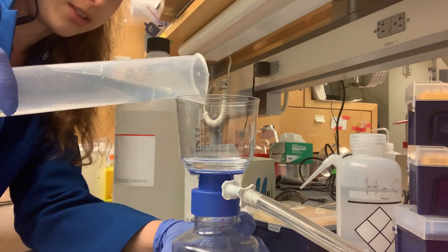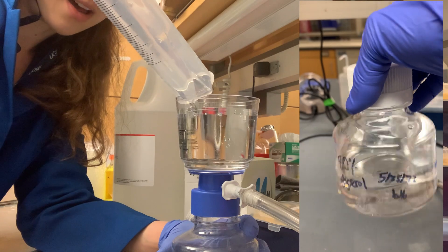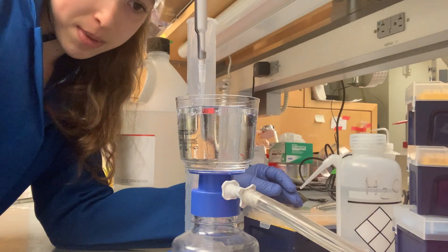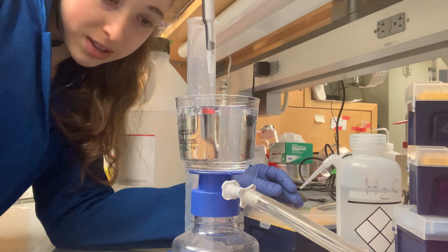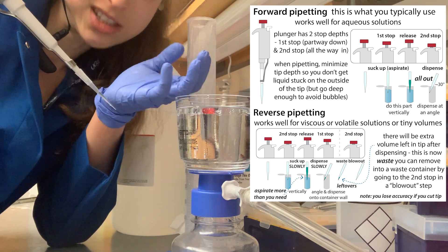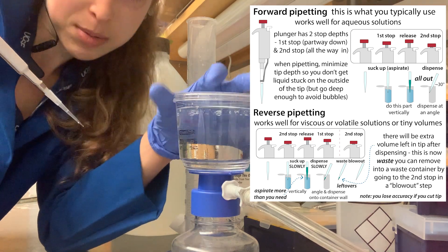There you can see it dripping through, giving you a filtered glycerol solution. You might have to leave it for a while, but in the end you'll have a solution that's much easier to pipette. You can already see it's pipetting much better than the 100% glycerol, but still remember to use careful techniques like reverse pipetting. Hope that helps — happy making glycerol!